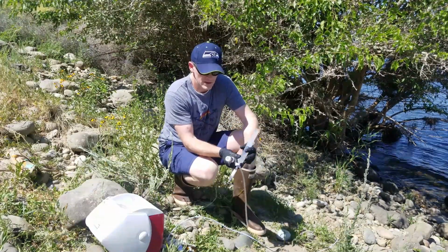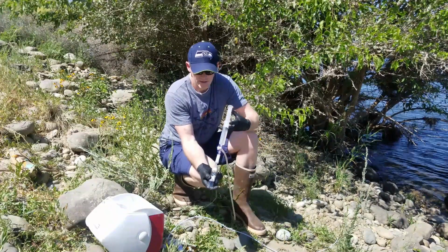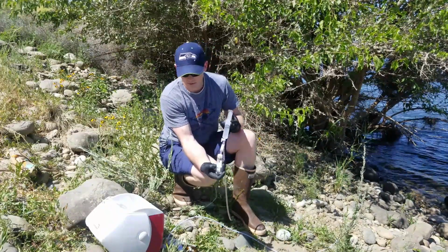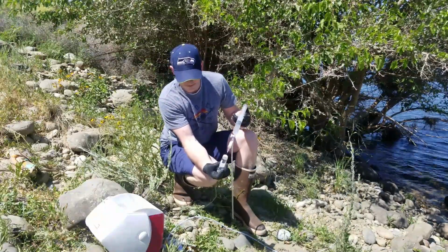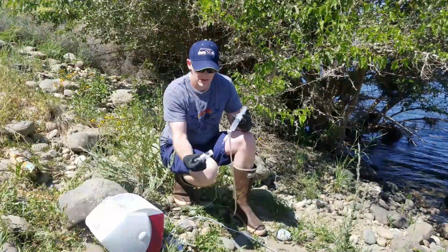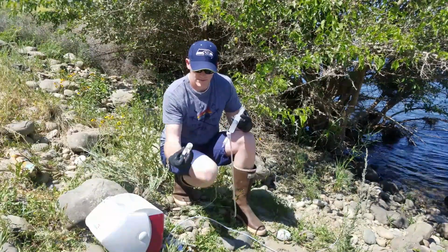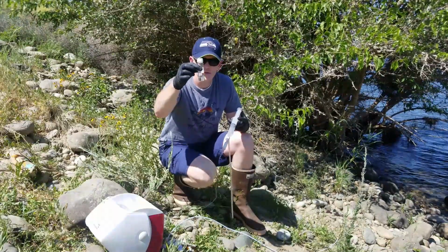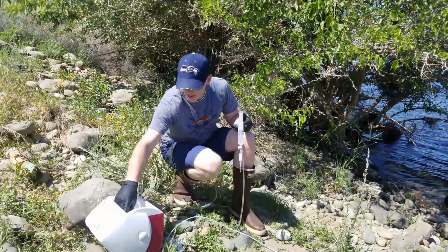So our first push point here, we're going to come in, we've already purged the line and everything. I'm going to sample a few mils into the clear vial. So, do a little bit more than that. Just going to eyeball this. A few mils, it's about right. Again, we'll get three samples to come up to halfway full. And then put this into the wet ice.